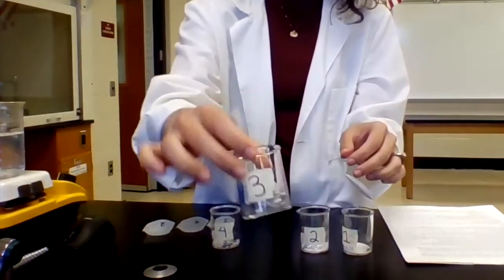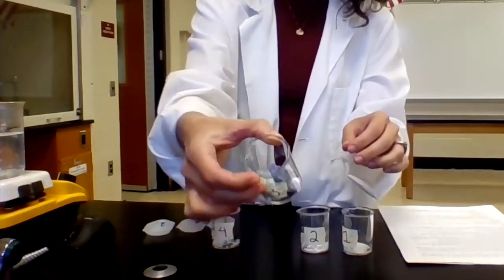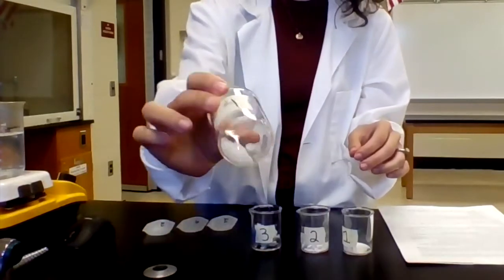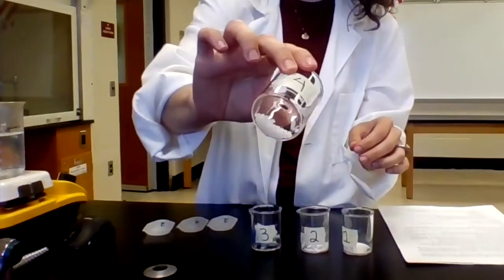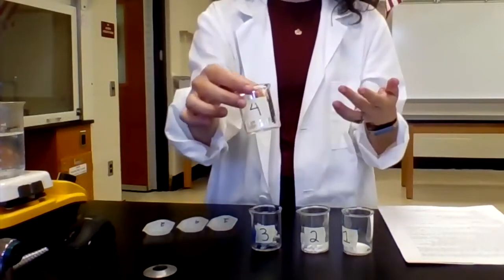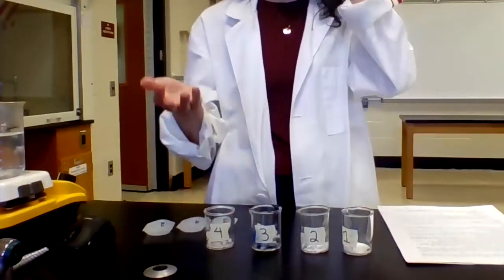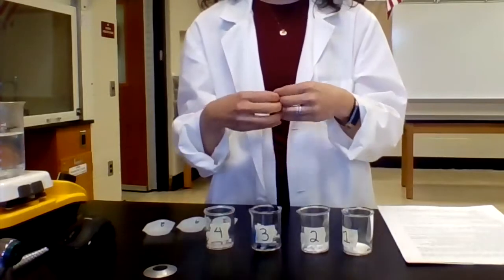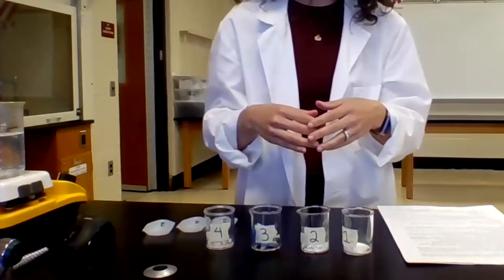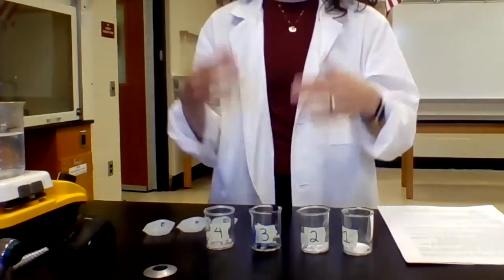For solid number 3, we see that it has this light gray color. And then for solid number 4, we have almost these pellets. Again, not a powder, not crystalline. So we want to write all of that down. We can see that 1, 2, and 4 are all white solids. But if that's all we say, then we miss some of those important descriptions that can help us distinguish between the different solids.